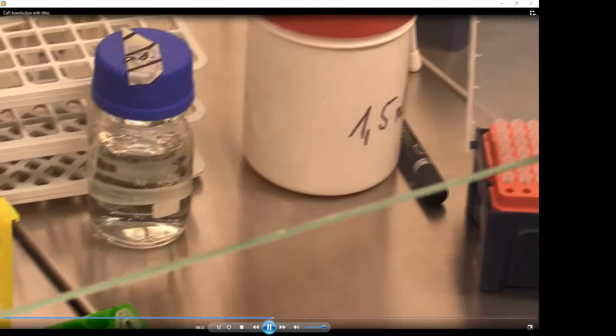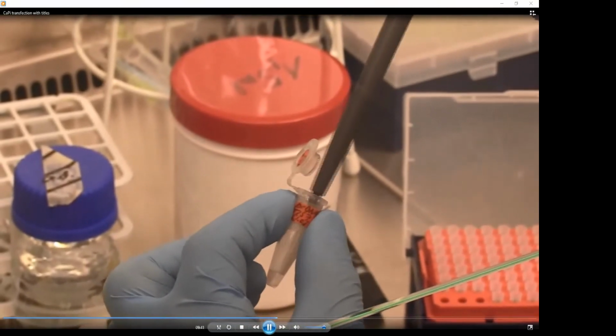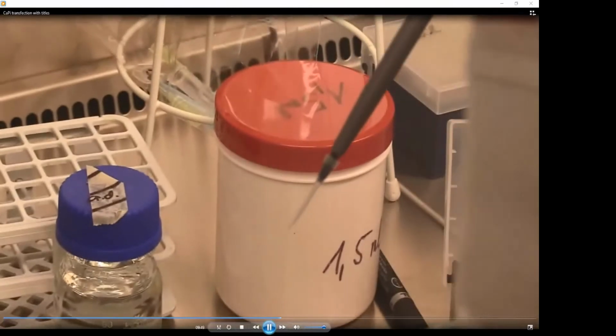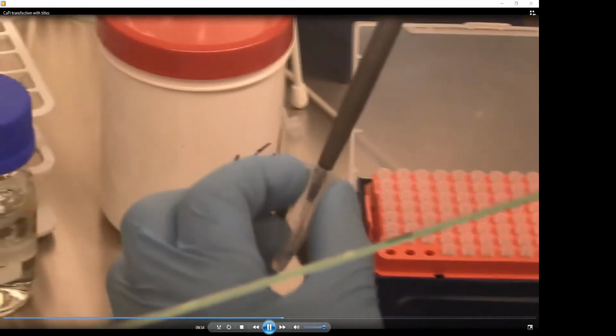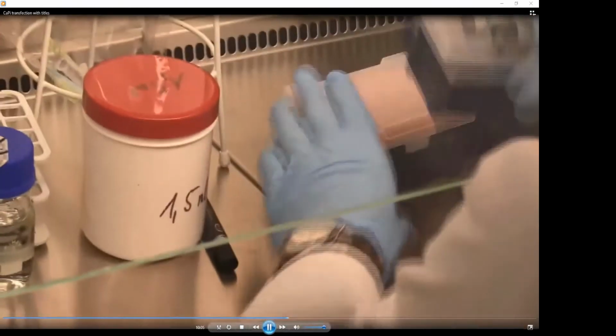So this is the plasmid vector containing T7. You have to add 1 microliter. Mix it first. Important is that all these stock solutions are properly labeled. So you see there the concentration of the stock solution, which is 1 microgram per microliter. You add it to the mixture where you have already your reporter. And then you have to add the calcium chloride.